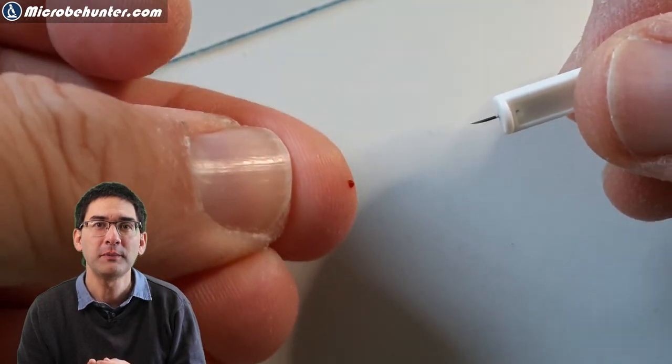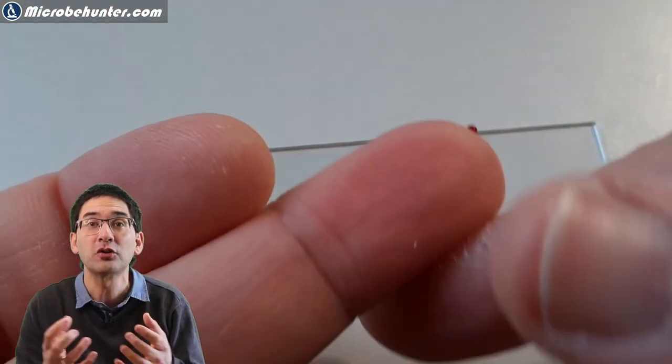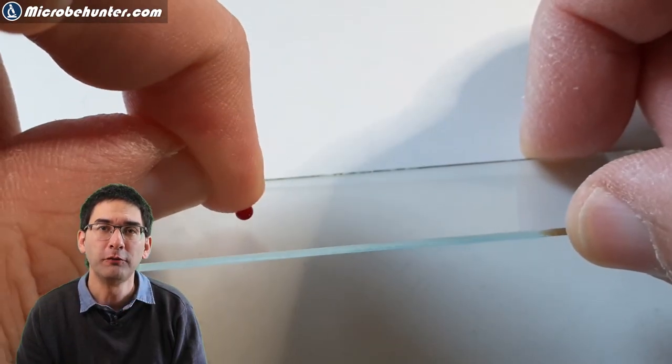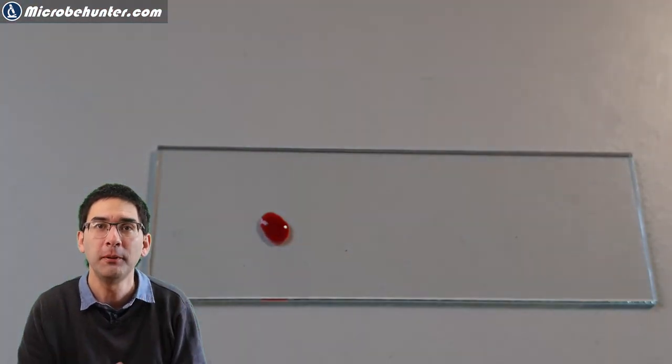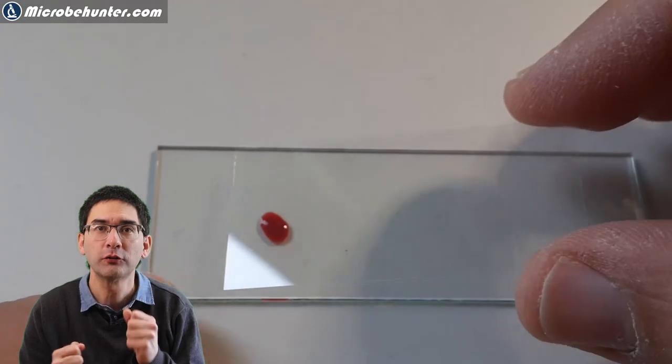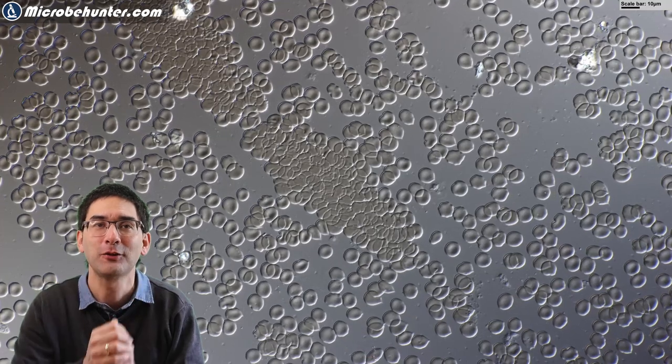The hole was very small and I needed quite a bit of pressure to press out some of the blood. The wound was so small that it immediately started to heal off again. But I first disinfected my finger with a little bit of alcohol. I do not want to get an infection. I quickly put a small drop of blood on the microscope slide. I say quickly because I did not want it to dry up. Then I used relatively large cover glasses and placed them on top. Due to capillary action, the blood film spread all across the slide. This created a very thin layer of red blood cells, which you're able to see here.